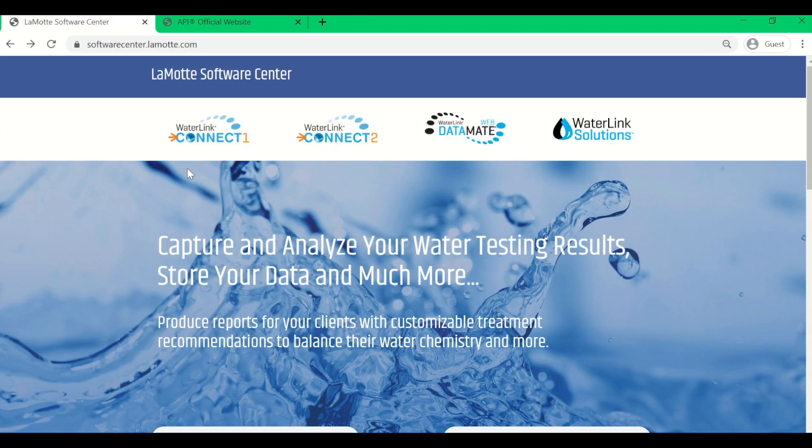Now that you have received your Aquaspin meter kit and know exactly what you will be getting in the kit, let's get to downloading the Waterlink Connect 2 software and creating your API Aquaspin retailer login. Let's first download the software. You will want to go to softwarecenter.lamotte.com. This can be found in your quick reference guide or instruction manual.